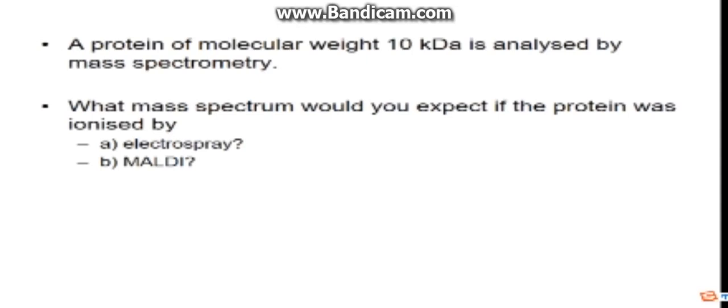How do you distinguish between them, if you've got more than one protein? Well, let's say you had a protein of 11,000 daltons, and that had 10 charges on it, then that would appear at a mass to charge of 1,100. Then you'd have the 10 plus of your other protein, protein A, protein B, and then you'd have a charge distribution of that as well. So you'd have them doubled, kind of. Yes, you'd have quite a complex spectrum.